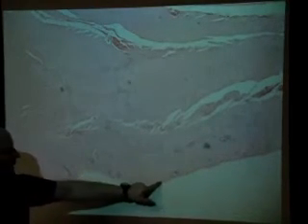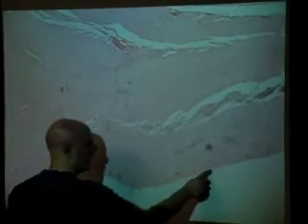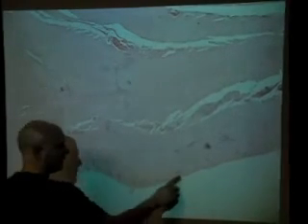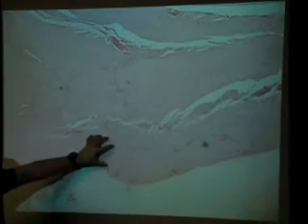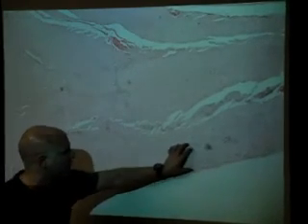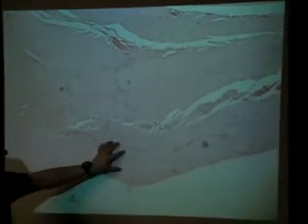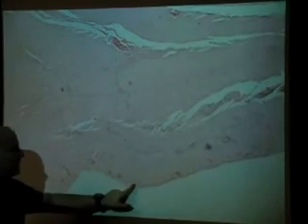And this right here is the serous layer. So this is the serosa, the serous membrane or serosa. This layer, you can almost see this line here. This is the longitudinal layer here. This is still circular here. Longitudinal is right next to the serous membrane.